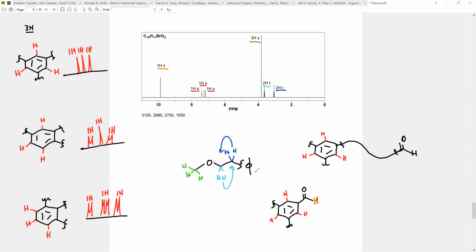Again, I need to put a 0 proton structure here. If I just do what I did last time, I'll sew this on here like I'm Coraline or something. And I'll go ahead and put this on like that. Okay, so I've kind of resolved all my hydrogens, and I have only one position left, and I really only have one atom left after the bromine, but I can fairly easily come to the structure right here. Okay, so this structure wasn't too bad. I tried not to make it too hard.